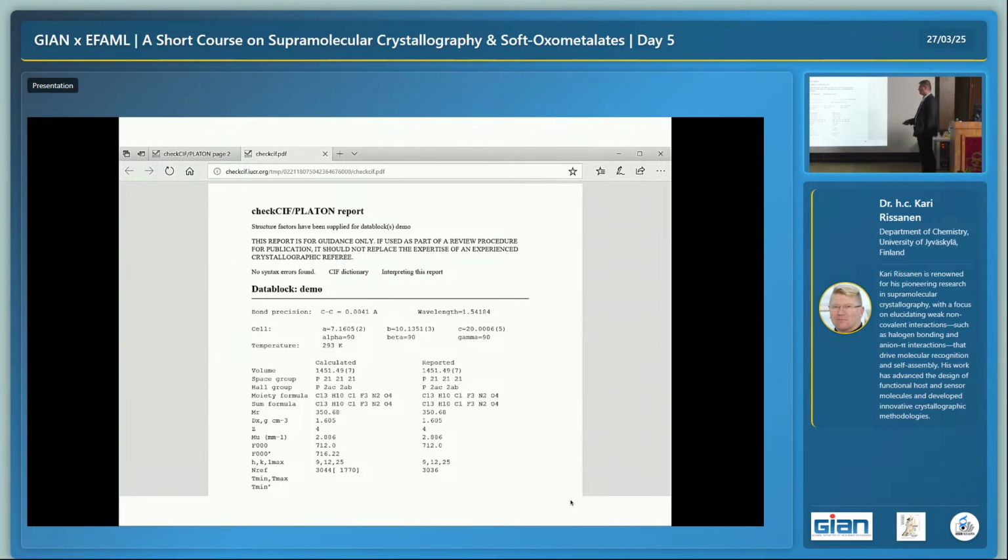So you can see theta max and theta min. This means, okay, and ref, number of reflections calculated 3044. Have collected 3036. But there are now actually 8 reflections missing. And 8 out of 3000 is nothing. Quite probably this is a technical issue from the instrument. The instrument has not been able to measure these 8 ones. But this is not a big thing.